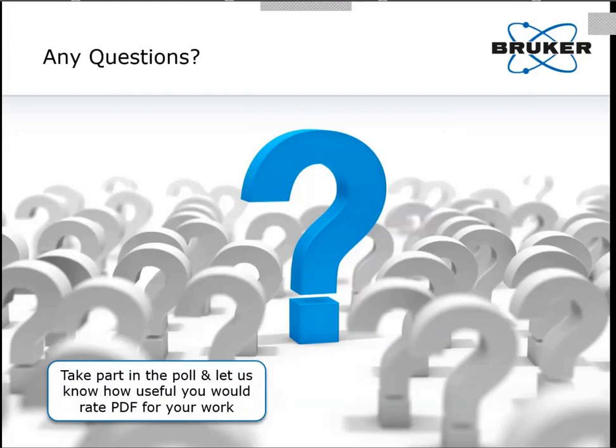So the next question here is, can I do analysis with a D2 phaser? Well, in principle, if your D2 phaser has a molybdenum source, you can do PDF in reflection. In fact, you can do PDF in reflection on highly absorbing samples in any case. So that's a different way of measuring the data compared to capillaries.